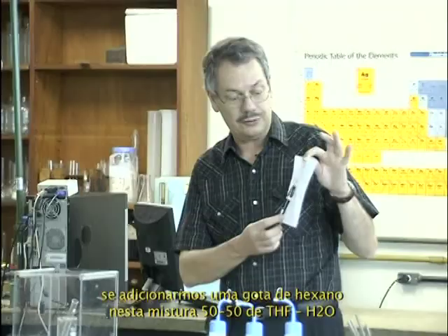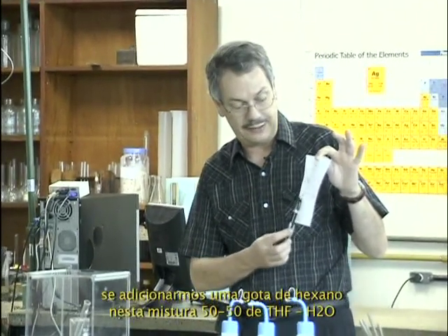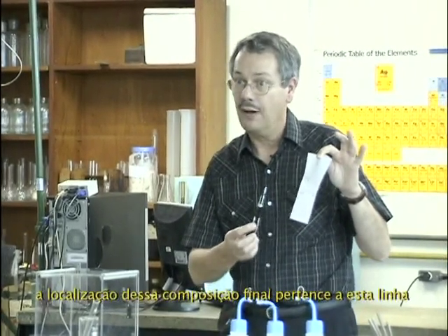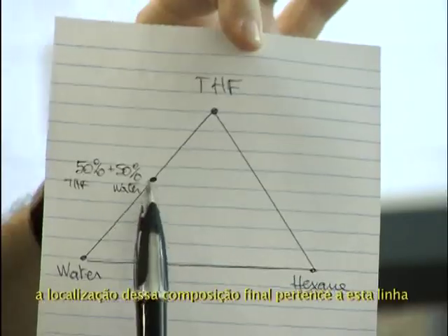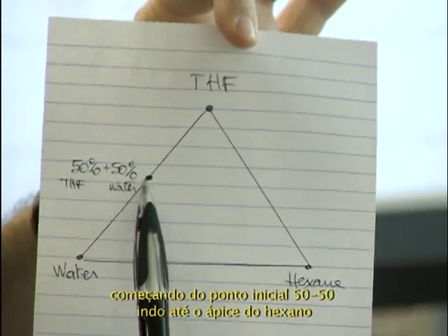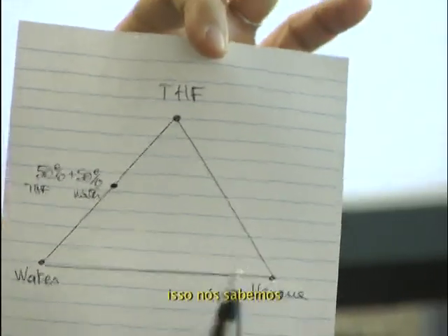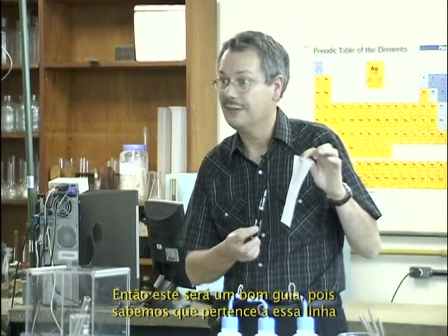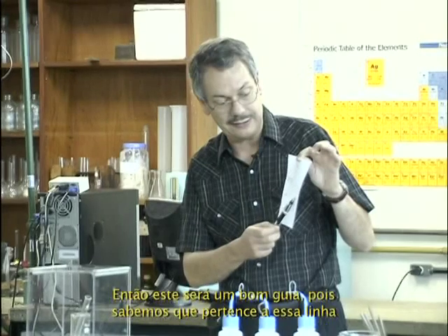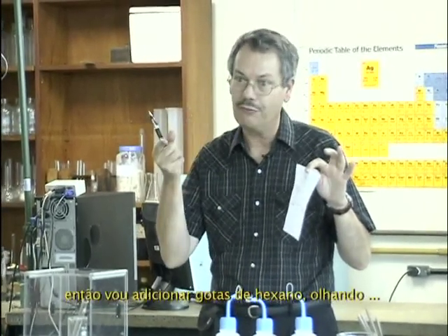And that's a property of the phase diagram. If I add a drop of hexane in this mixture 50-50 THF water, the location of the final composition belongs to that line, going from the starting point 50-50 up to the hexane apex. We know it. So that's a good guide. So I will add drops of hexane, just looking with my eye.